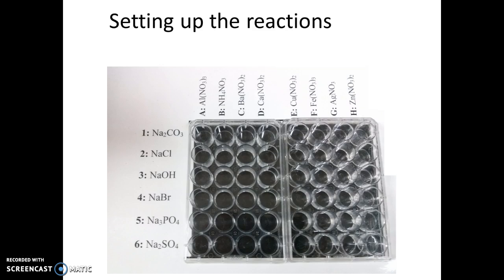You want to arrange your micro well plates on the template like this. Looking at the different columns—labeled A through H at the top—I'm going to start with column A, which is labeled aluminum nitrate. I'm going to find the bottle of aluminum nitrate in the lab and add four to five drops of aluminum nitrate to each well going down column A, marked with a red X here.